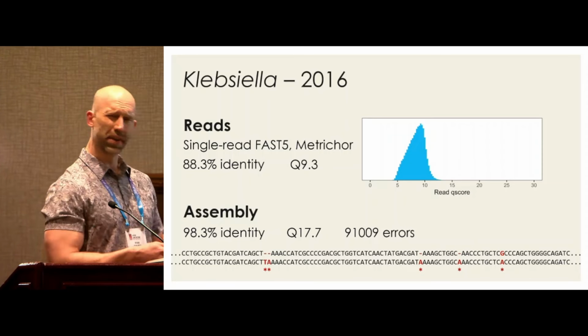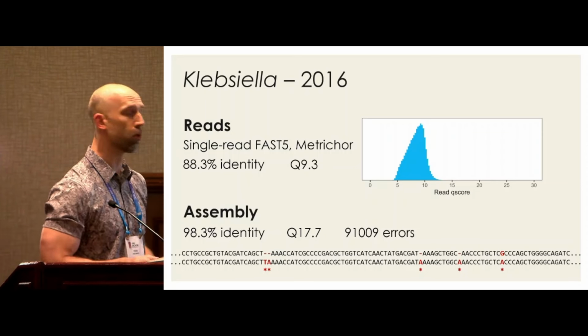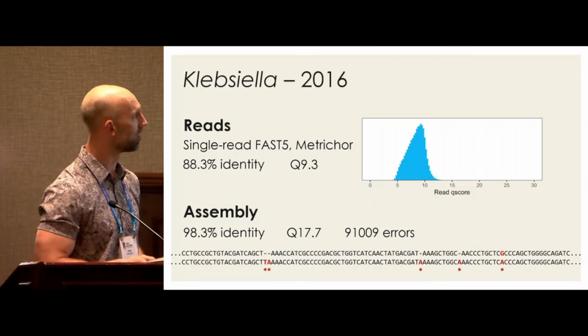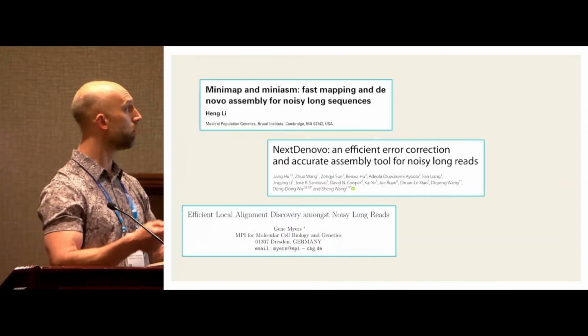These very low quality reads also created a huge bioinformatics challenge because a lot of the algorithms that were developed used things like k-mers that assumed you could get pretty long stretches of accurate sequence, and they completely didn't work on reads with more than a 10% error rate. So this resulted in a huge burst of algorithmic development. And there were all these papers coming out using new algorithms that could work with such error rates.